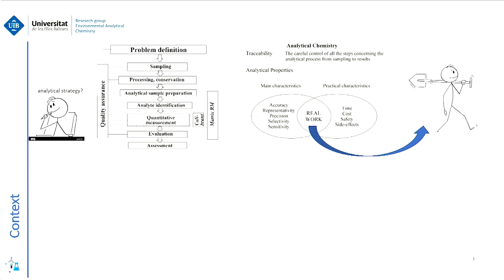When we start to think about the analytical strategy, we have a problem: what kind of steps do we need to follow? We need to check the analytical traceability and many characteristics.